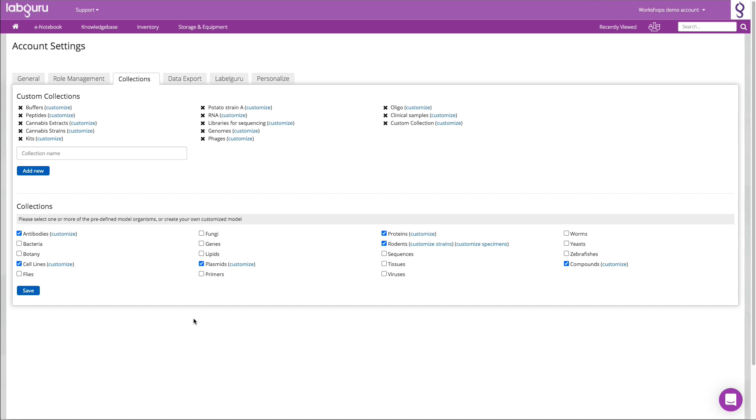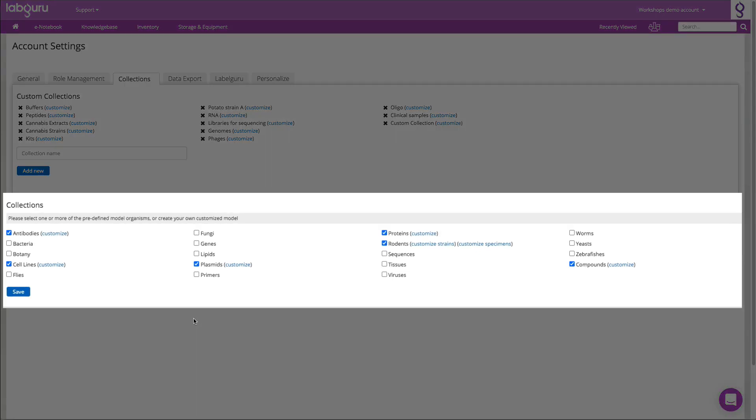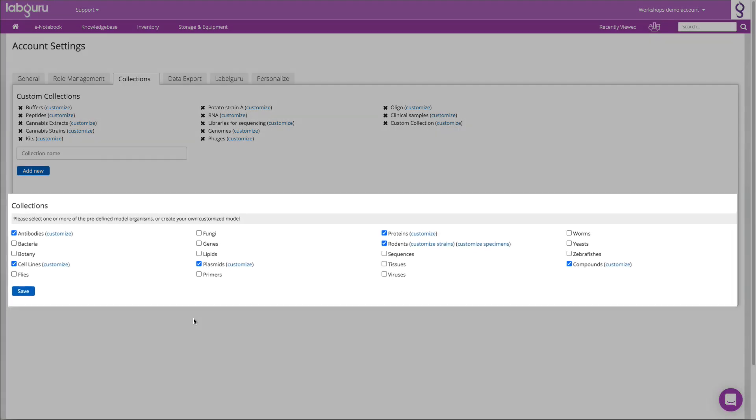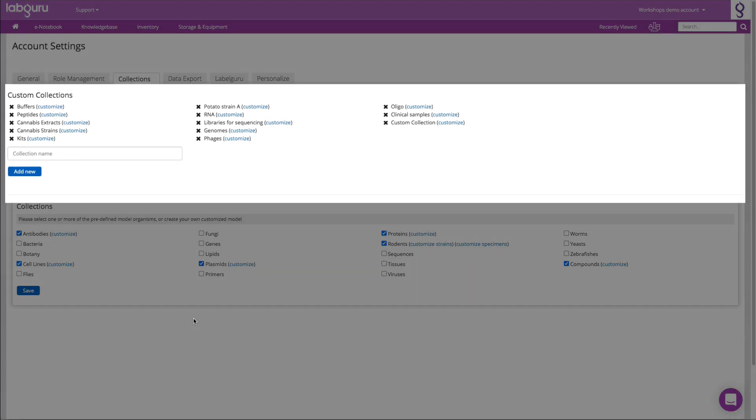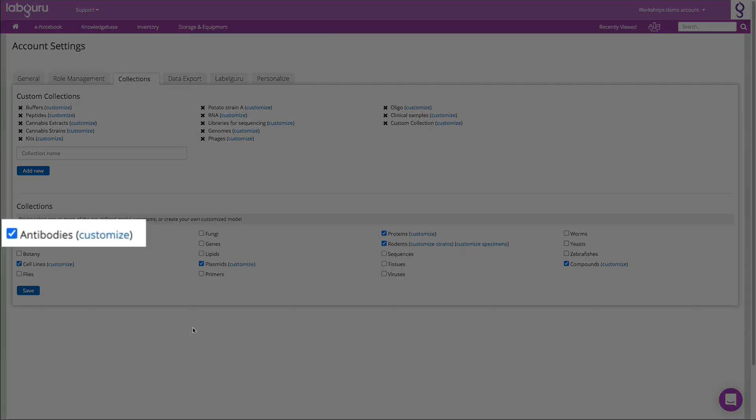To do so, users who are defined as admins have access to the inventory settings. You can use the default collections we offer at the bottom of the screen, or you can create your own custom collections if you want to add anything to that list.